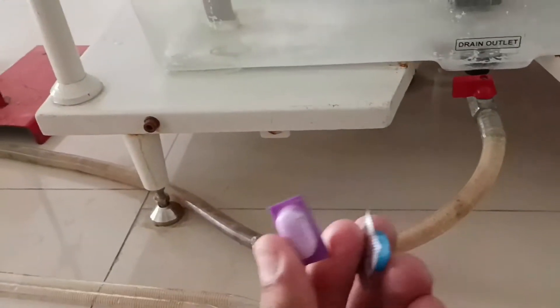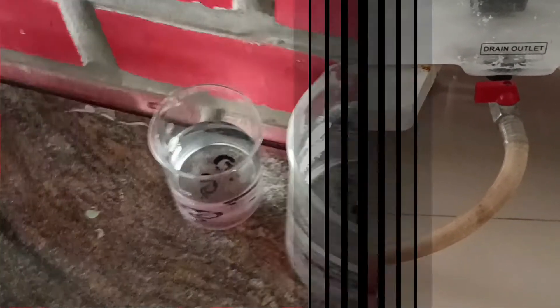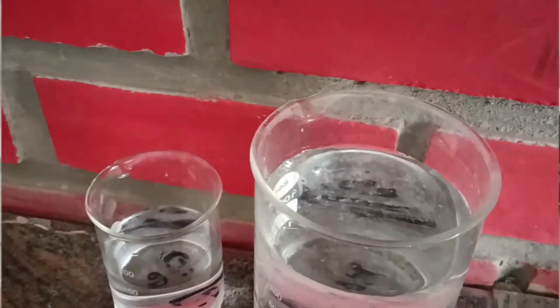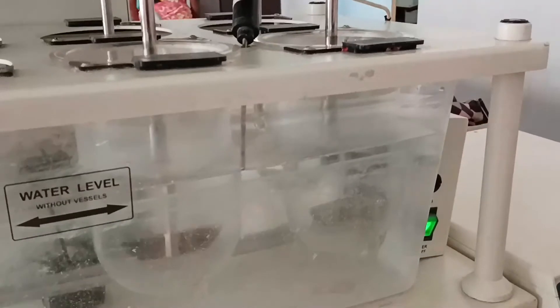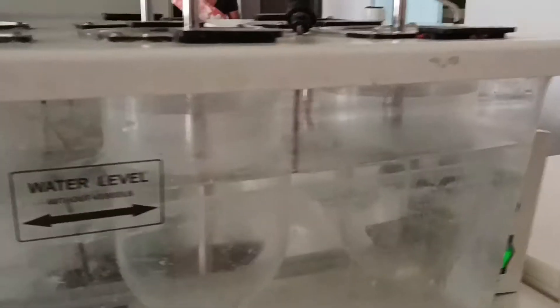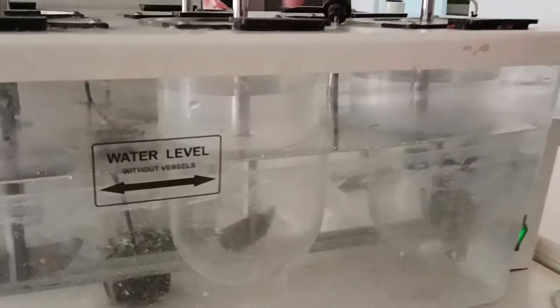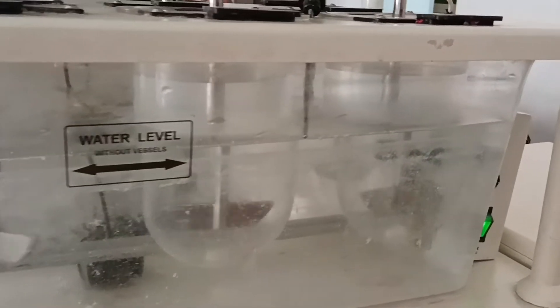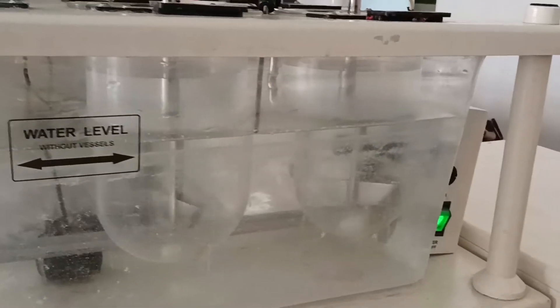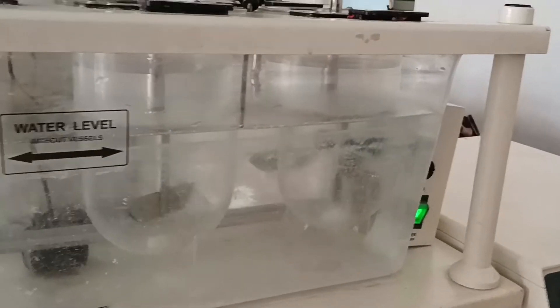This tablet is paracetamol. One is Calpol and the other is Dolo 650. This is the first tablet. She is adding Calpol and paracetamol, and adding Dolo. After 15 minutes we will show you the results.